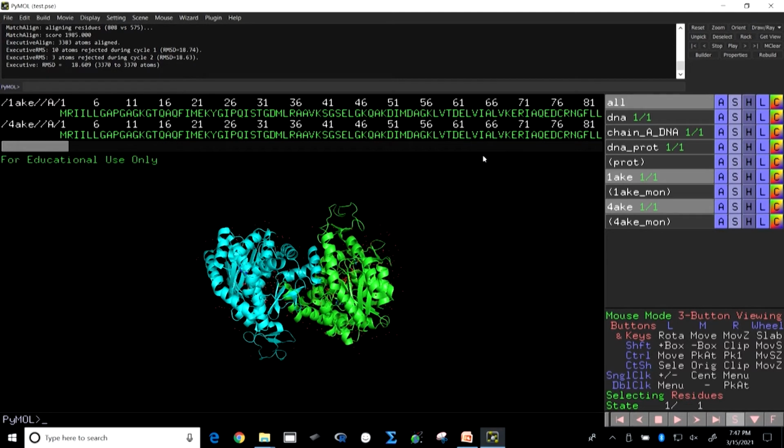So, they could be rotating in this screw axis. You should remember very, very correctly, this is one of the most fundamental lessons to use molecular visualization or to deal with structure.